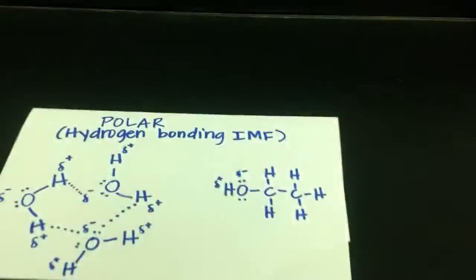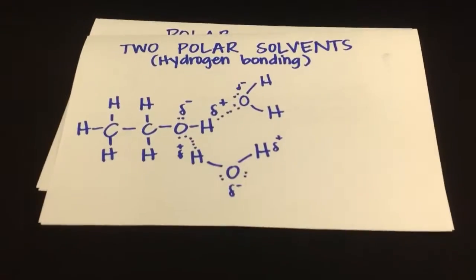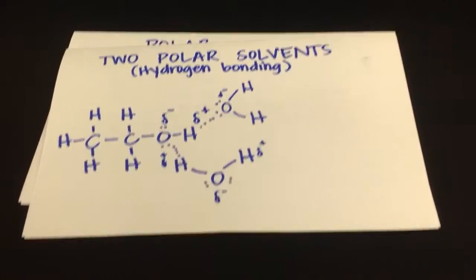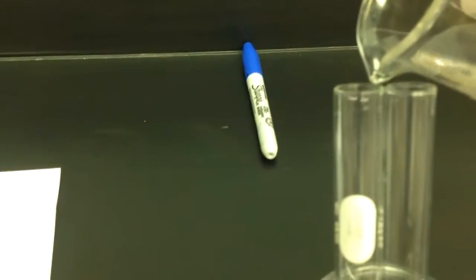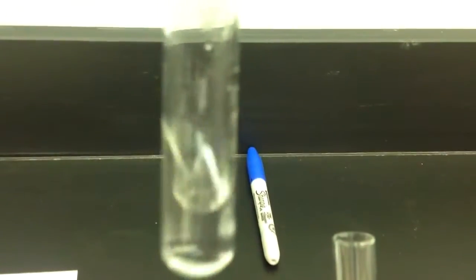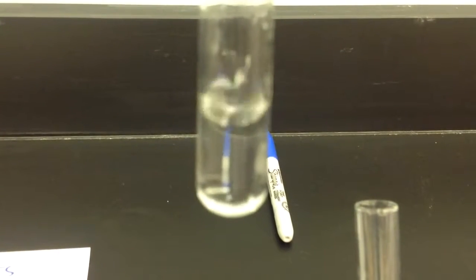However, when I add my polar solvent to another polar solvent — say I add ethanol to water — then we do not see the formation of layers. So when I do ethanol in water, there's my water that I'm pouring in. Ethanol is already in the test tube. There are no layers that form. They are completely miscible in each other.